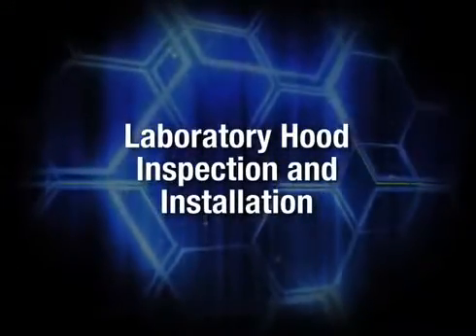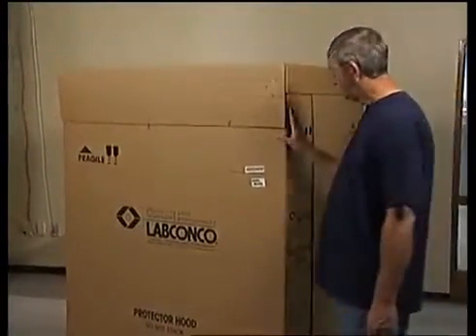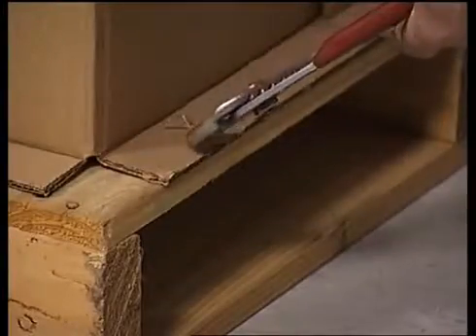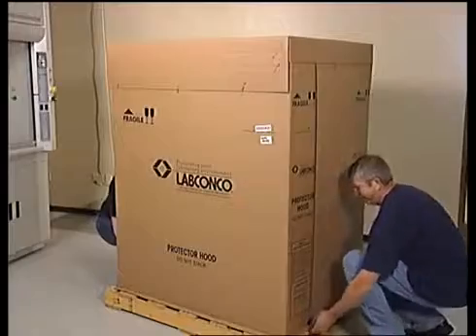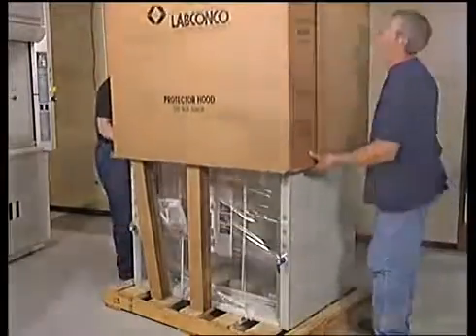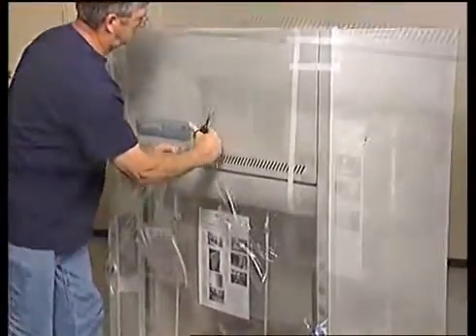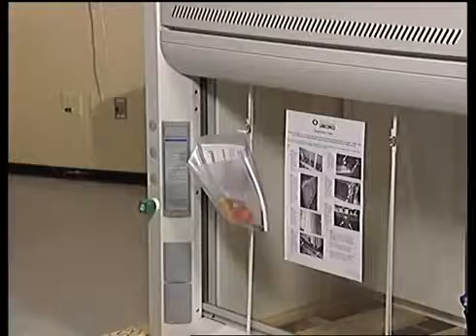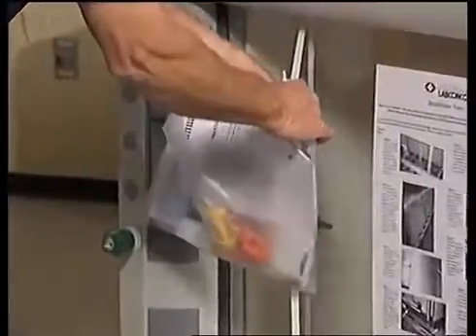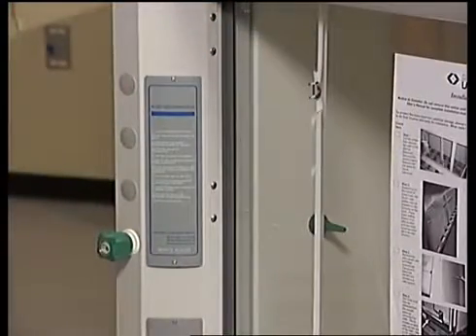As with the base cabinet, your Protector Premier hood and carton should be inspected and any damage reported directly to your carrier. Remove the staples securing the carton to the pallet. Remove the outer carton. Do not discard the packaging materials until all components are checked for damages. Cut the shrink wrap with scissors to avoid scratching the fume hood. Remove the plastic envelope that contains your installation instruction manual and accessory hardware. Refer to the instruction manual during installation and set aside the accessory hardware for future use.